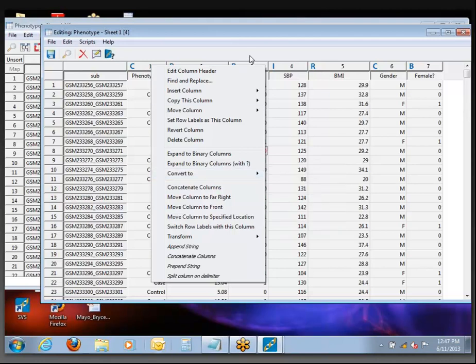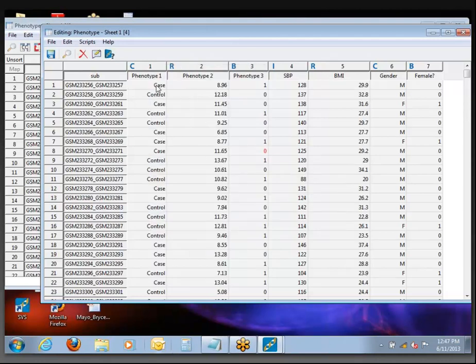If you ever need to convert between different data types — and just to back up a little bit — you see this blue letter C? That indicates that the software recognizes it as a categorical variable. R means it recognizes it as a real number or floating point value. The letter B indicates binary, I means integer, and there's also G, which is genotypic — that's the last column type.